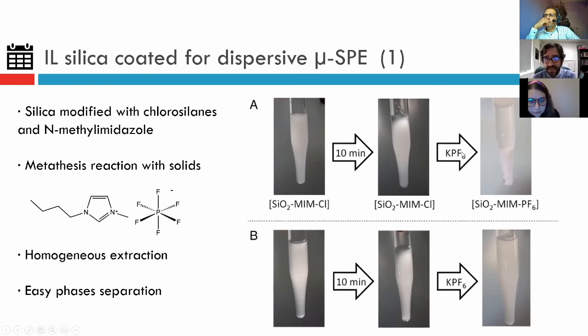But if we add the hexafluorophosphate, we break the dispersion easily. If the same procedure is applied to non-modified silica, the behavior is completely different.